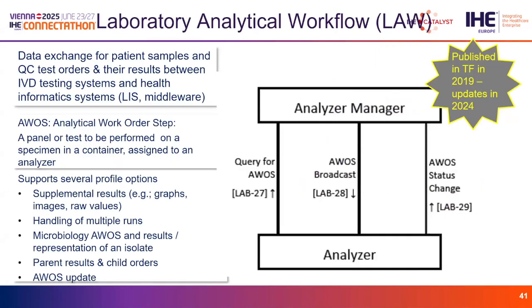So we have the analyzer manager, that is the actor linked to the laboratory order world that we have just seen in the laboratory testing workflow, and then the analyzer part, which is the actor that is responsible to execute the tests on the specimens.